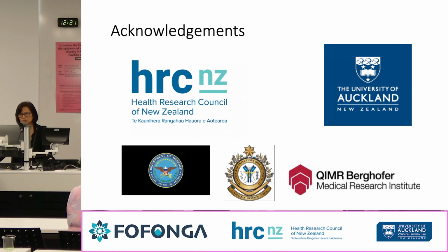I'm also working on malaria and arboviruses, dengue, Japanese encephalitis. So all the lessons learned, I started multiplex digital PCR with the malaria work. It has crossed over now to scabies. So I learn from the multiple projects that I do. With that, thank you very much.